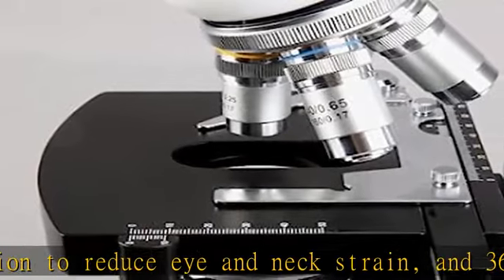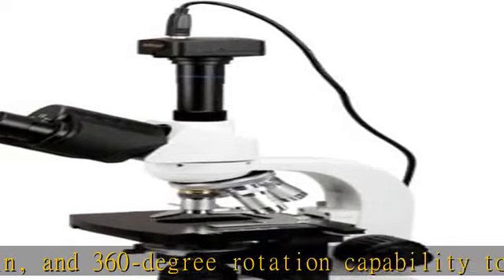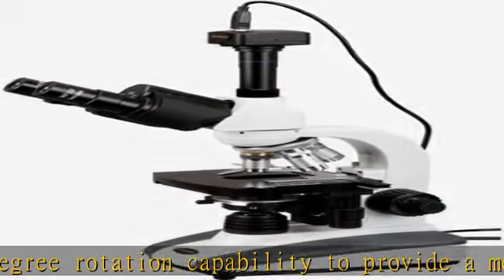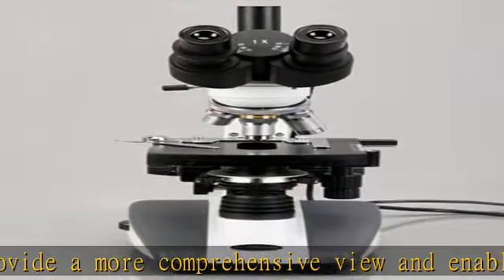Double-layer mechanical stage with 1mm stage divisions, locks slide into place and provides precise slide manipulation along the x-axis and y-axis to allow coordinates to be recorded, enabling the viewer to return to a specific location on the slide. See the description to get this product today at the best price.